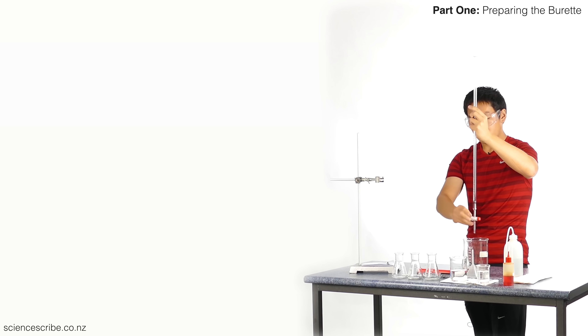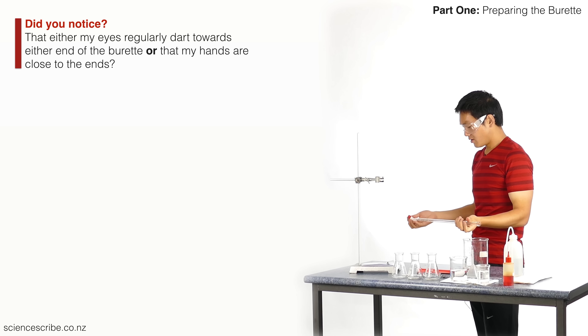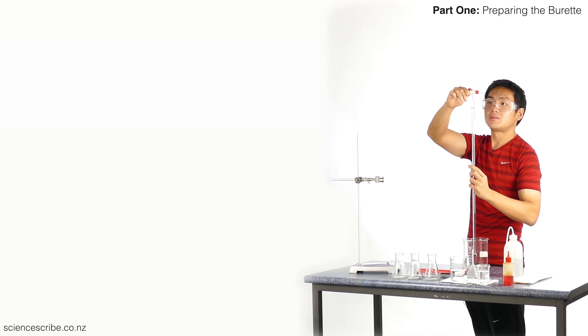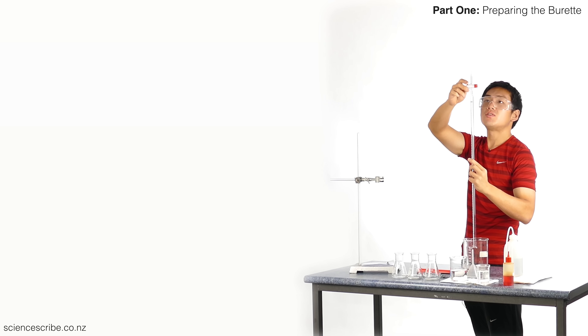Open the stopcock both ways and tilt to the side. Rotate, move that liquid back and forth along the length. Remember to scan the length with your eyes so you don't get random spills — out one end, then open it up and let that drain. At this point your burette is now clean.